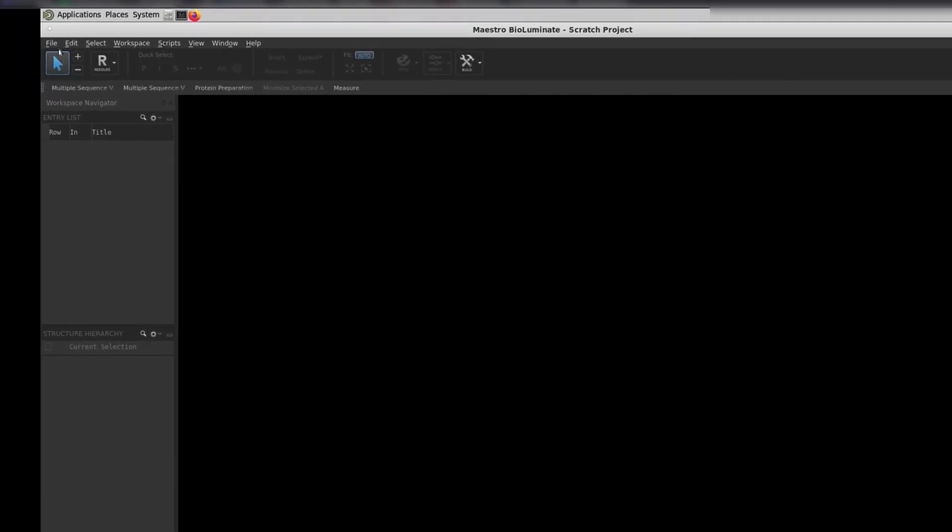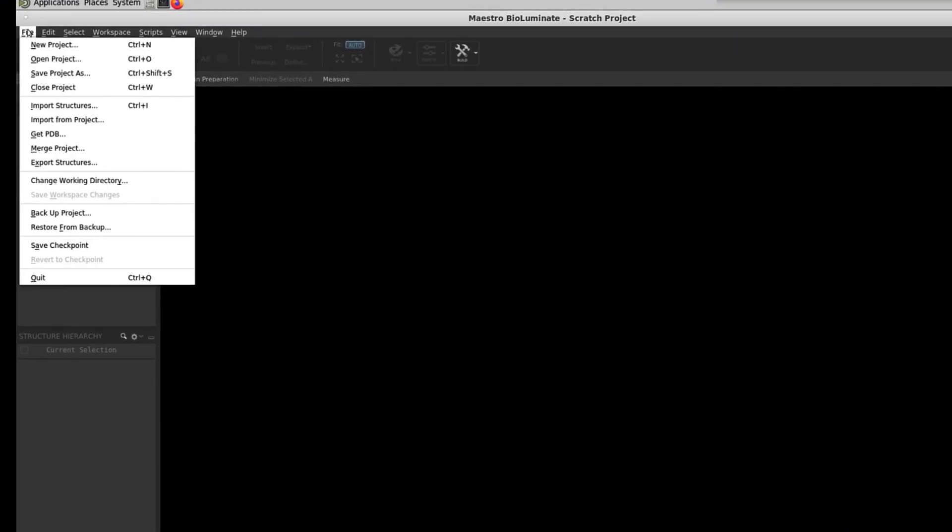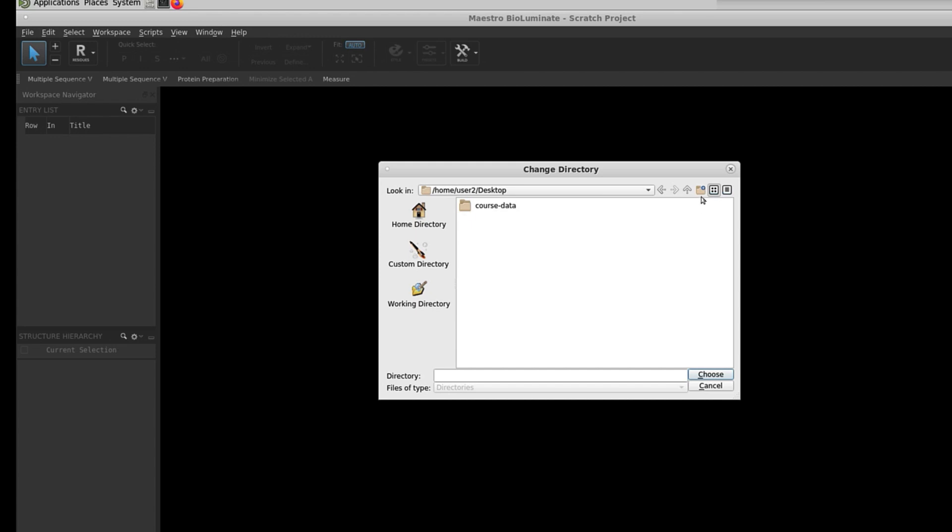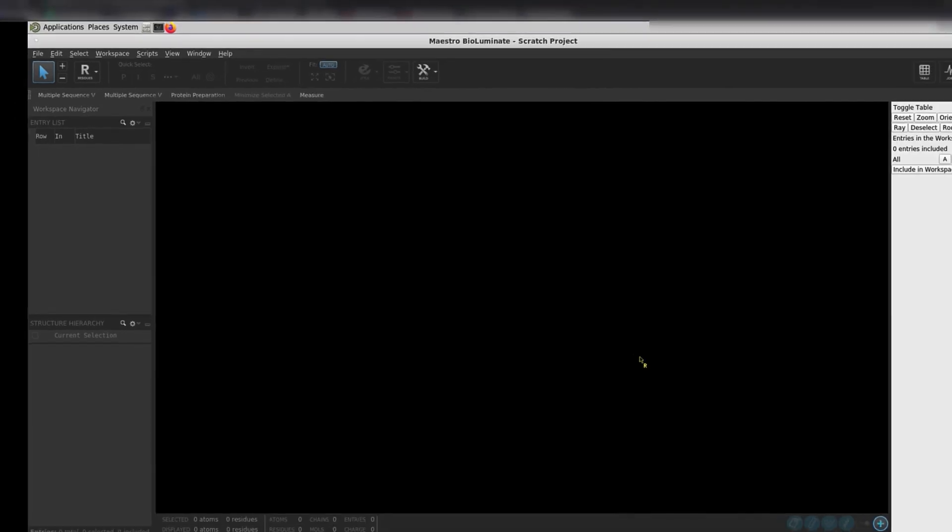Now, go to File and choose Change Working Directory. Here, you will select your desktop, then click Add a New Folder. Name this folder Course, and click Choose.